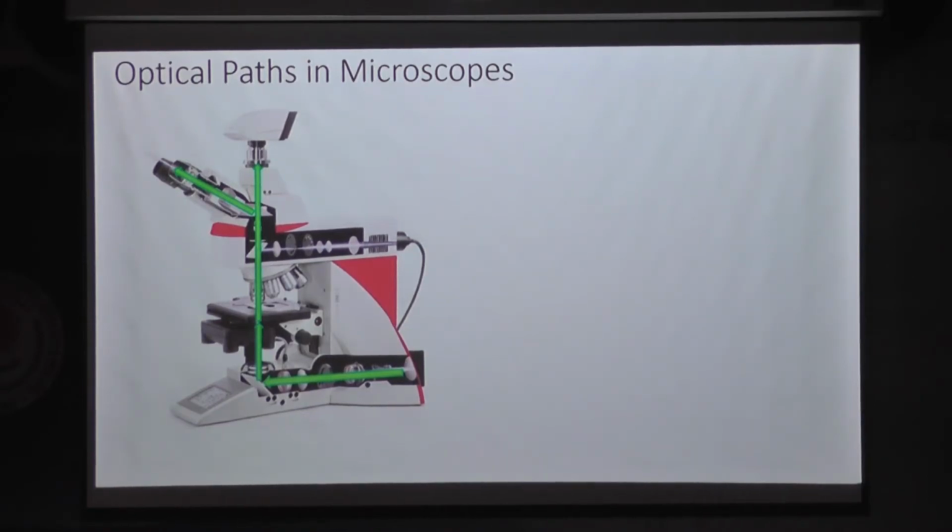So what happens in a bright field microscope? Some microscopes start the light from here itself, and some start from here. There are different microscopes. For more complex microscopes, the light starts from here. For example, if I am using a multi-headed microscope, where 10 or 20 people are seeing the objects at one time, then I need a bigger light source so that the light gets divided equally among all the 10, 20 users.